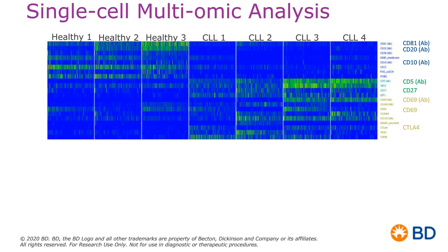And of course that is probably indicative, and it explains a lot why we have this unique clustering of these cell populations for each CLL, and really drives home the fact that these samples are in fact very, very unique, and reveals further that heterogeneity of CLL itself.